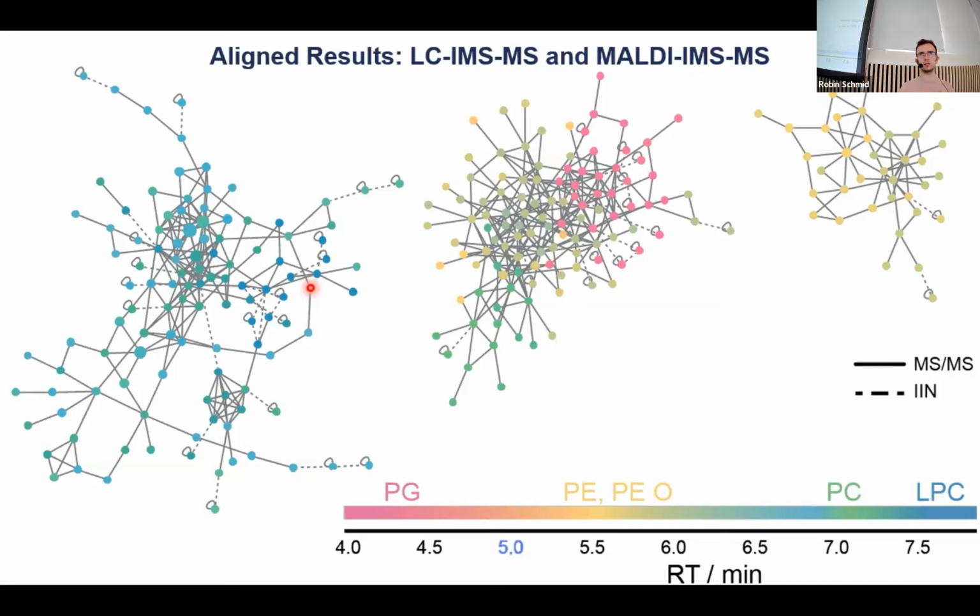For example, this phosphatidylcholine in positive mode has to produce the phosphatidylcholine head group fragment, or in negative mode, we also need to see the fatty acid chain fragments. And if the fragments have these mass-to-charge ratios, then it must be this fatty acid. So that's basically a computational spectral library.